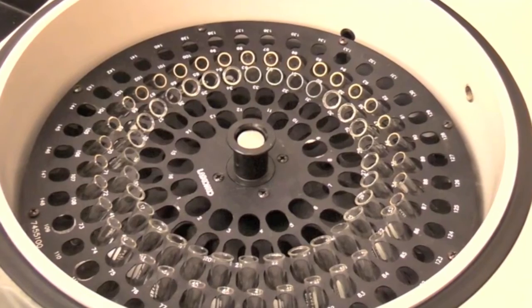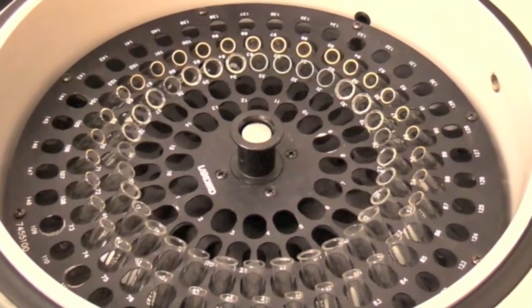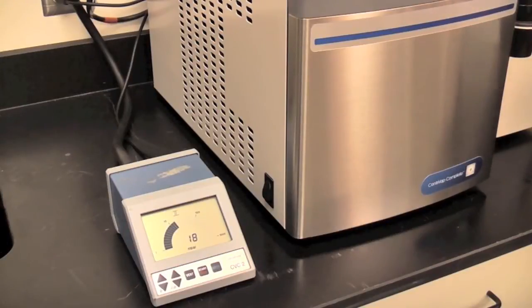The included rotor holds micro-centrifuge tubes and 12 or 13 millimeter test tubes. An oil-free diaphragm pump pulls to 7 millibar for optimum evaporation.